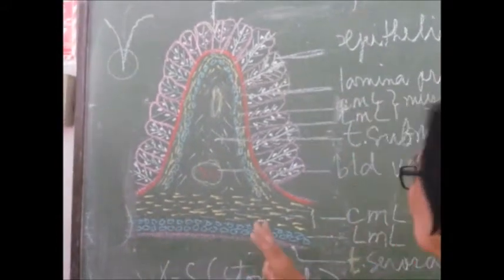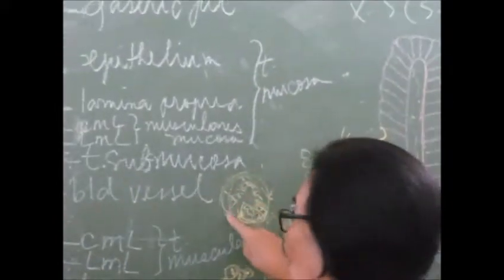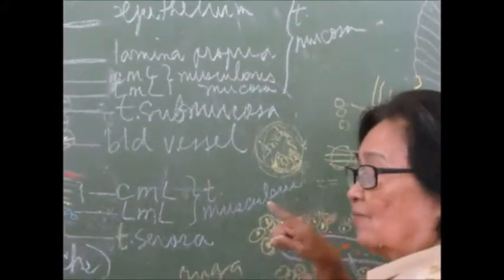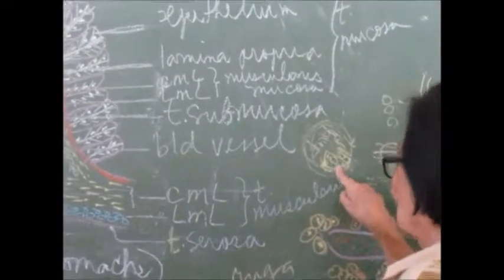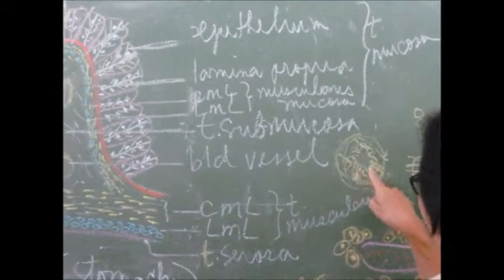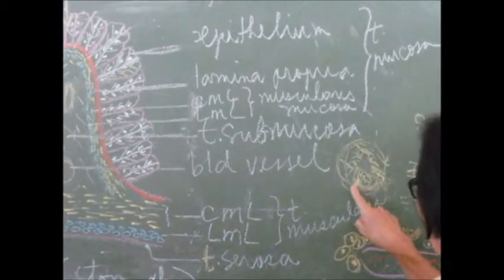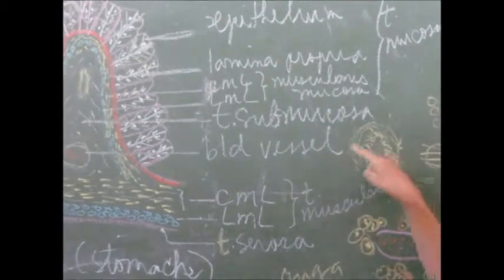I repeat, what you find in one ruga is true with all the other parts. And I gave you an analogy. When we eat the cake, you don't eat the whole cake, but we only get a slice. Because what you find here and what you tasted is true of all the other parts.